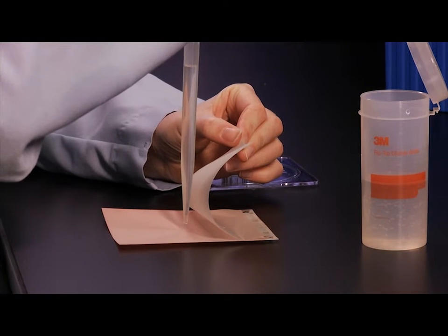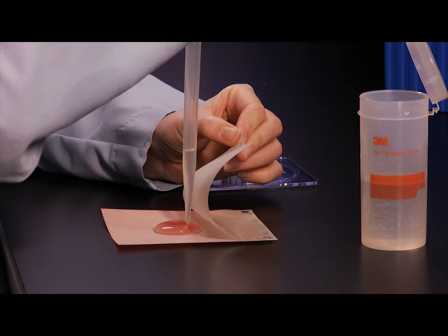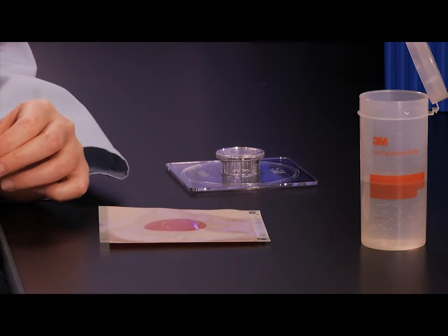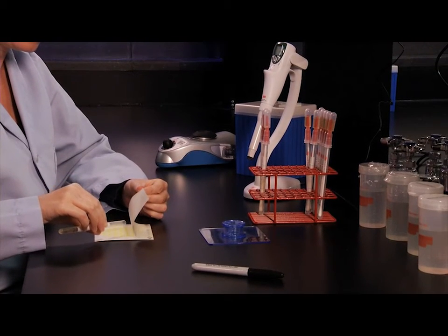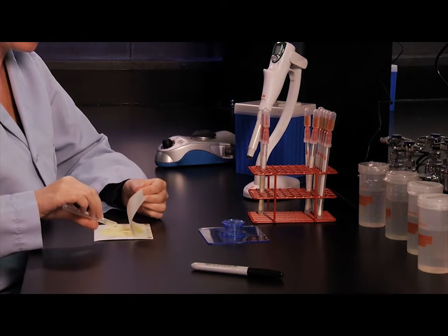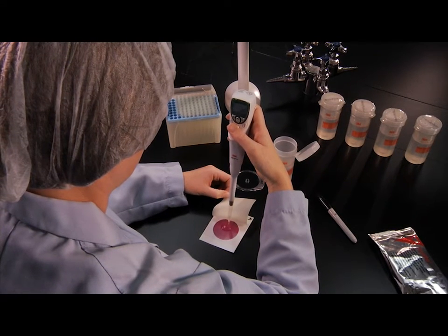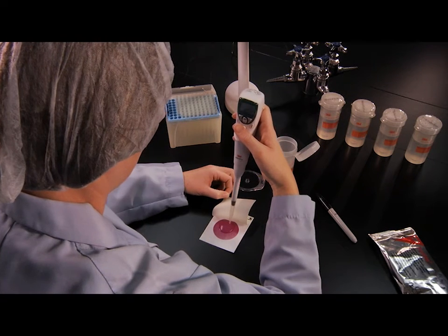A sample volume of 5 milliliters is required to inoculate the 3M Petrifilm high sensitivity coliform count plate, and a sample volume of 3 milliliters is required for the 3M Petrifilm environmental listeria plate. All other 3M Petrifilm plates require a 1 milliliter sample for inoculation.